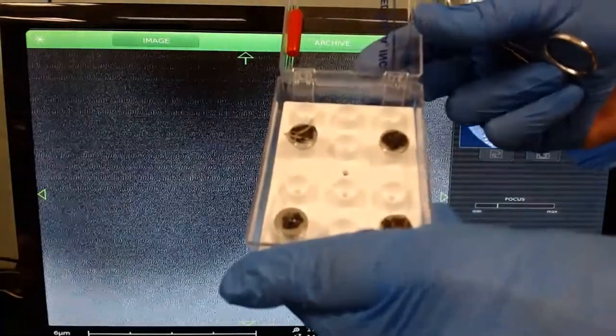New samples? Yep. Awesome. Let me get this one out. And so for anyone that's interested, the samples we got now have been metallized using a sputtering system. And we'll post video on the channel. I'll grab some video. Cool. Alright, so I'll just go ahead and eject this one. And I want to do the snake skin first.